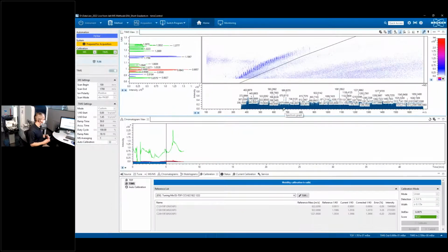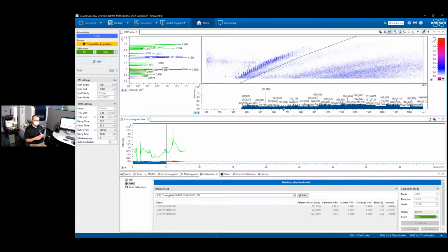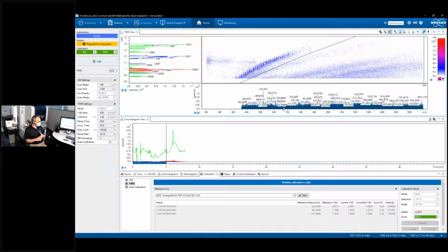Right, brilliant. There's a question on setting up the DIA methods. We'll come back to that. Is PASEF similar to Proteome Discoverer or PEAKS?